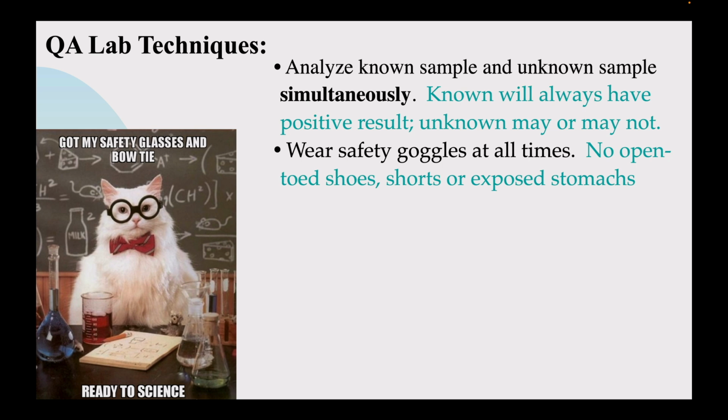You definitely want to be safe in this lab. You want to wear safety goggles all the time. Don't have open-toed shoes. Don't wear shorts. Don't have any exposed stomach kind of shirts on, because that's bad. I really want you to be safe, all right? So I'm being a little extra careful here.